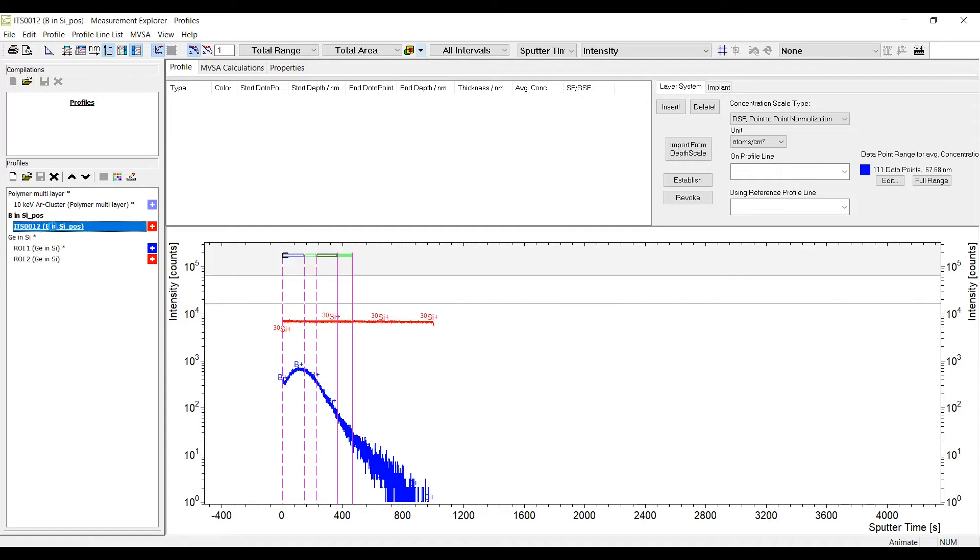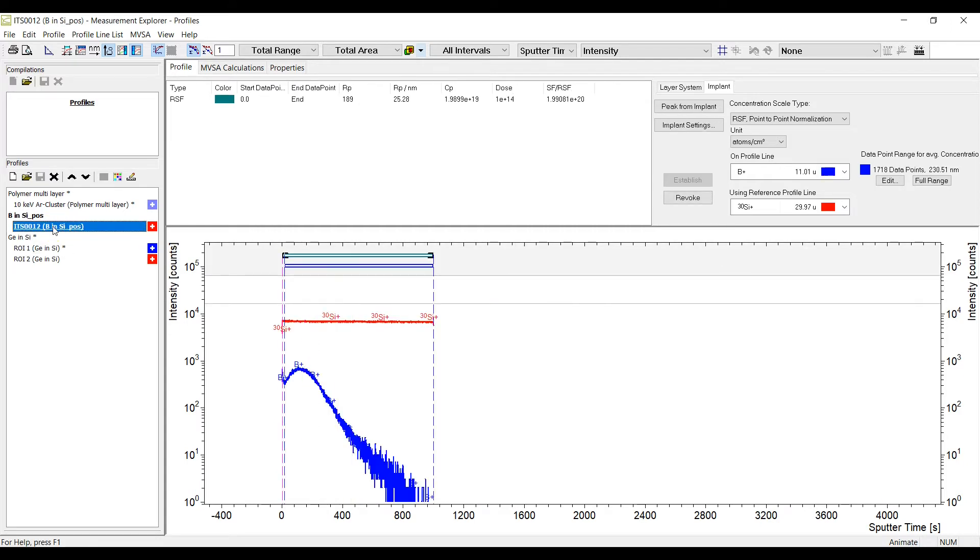For quantification of implants, typical parameters like dose or peak position can be specified.